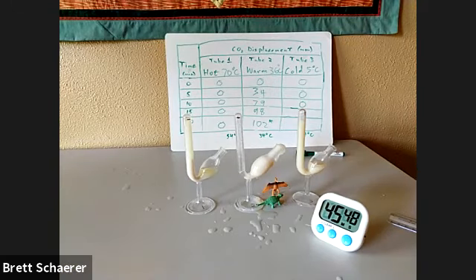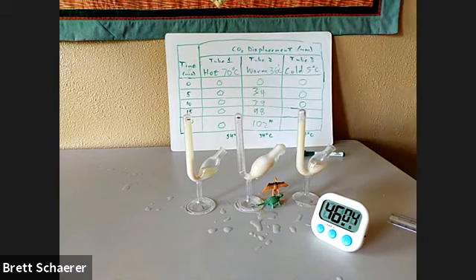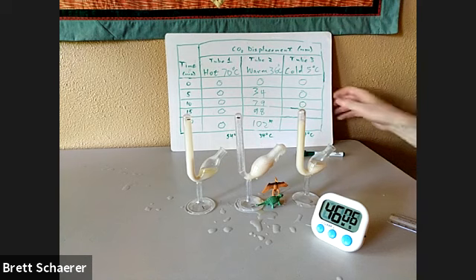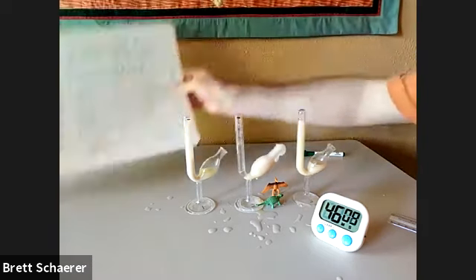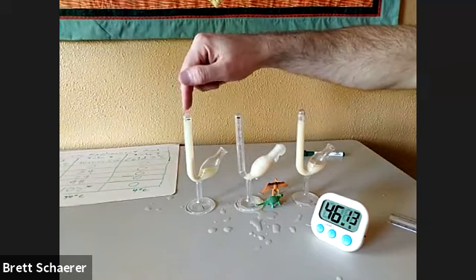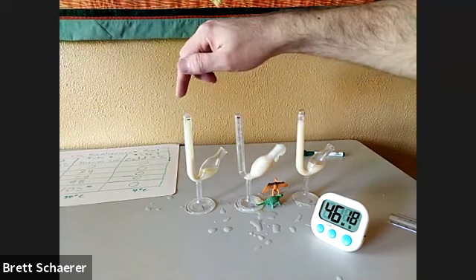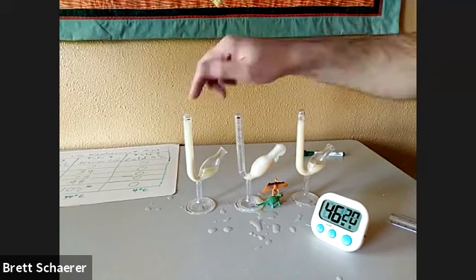Okay, it's been about 25 minutes since the official experiment finished, but we just took everything out of their different temperature environments to see what would happen. And as we can see, the one that was in the warm environment is continuing to ferment and kind of making a mess that the lab assistants and I will have to clean up. The tube that was in the hot environment, the 70 degree to 54 degree, it's still at 0. So there's been no fermentation in that tube at all.